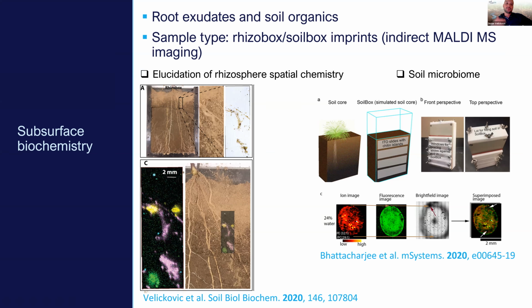So we still need to improve this by changing the chemistry of the membrane that we transfer the material to. We still hope that we can improve. But currently, in this particular case, the blotting was around 24 hours.